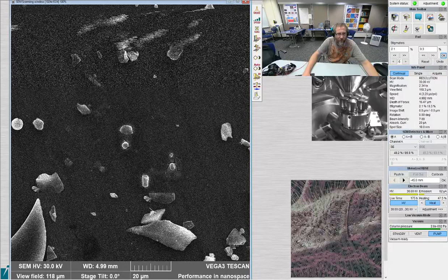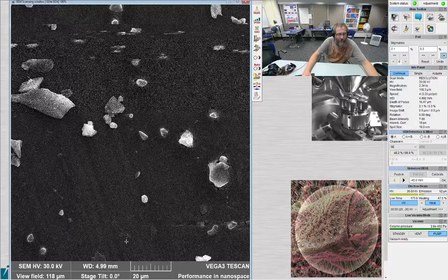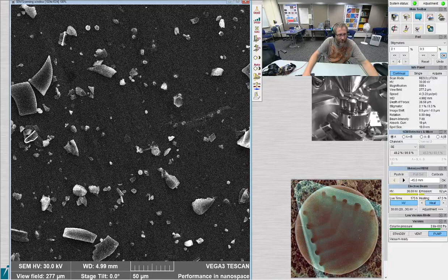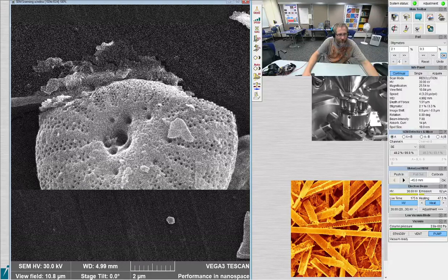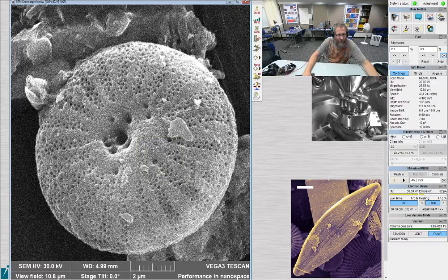What were you ooing at? There's something towards the bottom of the screen, looked like a circle with a big undulate face. Oh, yeah. This one? Yeah, this one here? Is that what you're talking about? Yeah. Yep, it does. I think it's the same thing, the little one. It's really small now. Though this one didn't get so extremely undulate at its smaller size.